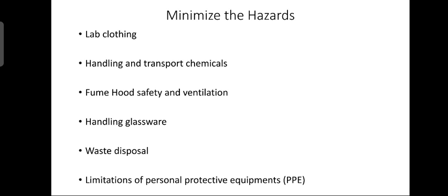When large bottles of acids or solvents or other liquids are transported within the laboratory without a cart, only one bottle should be carried at a time. The bottle should be carried with both hands, one on the neck of the bottle and the other underneath. Do not hook a finger through the glass ring on the top of the bottle, allowing it to dangle while being transported.